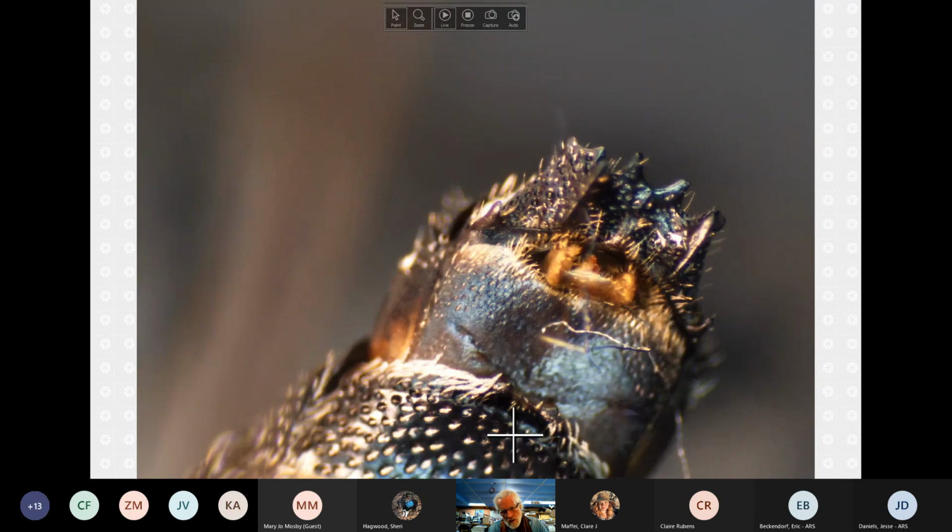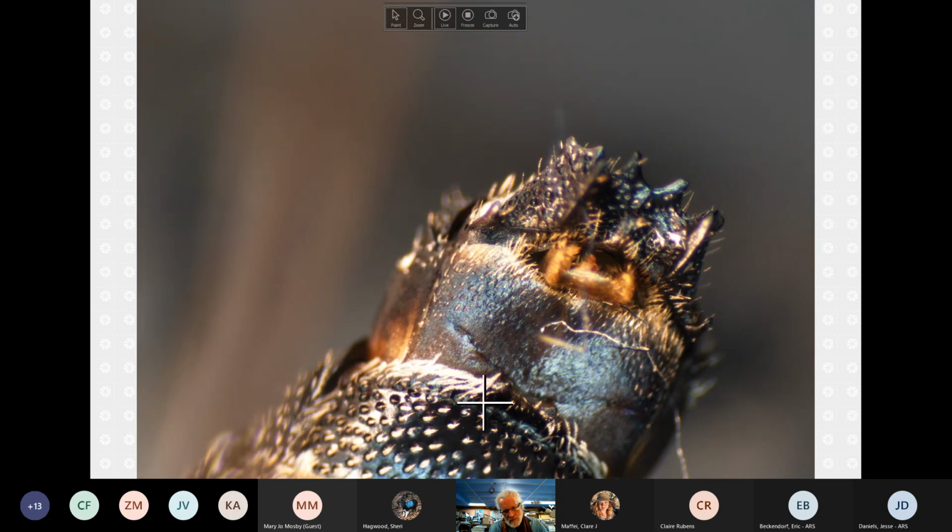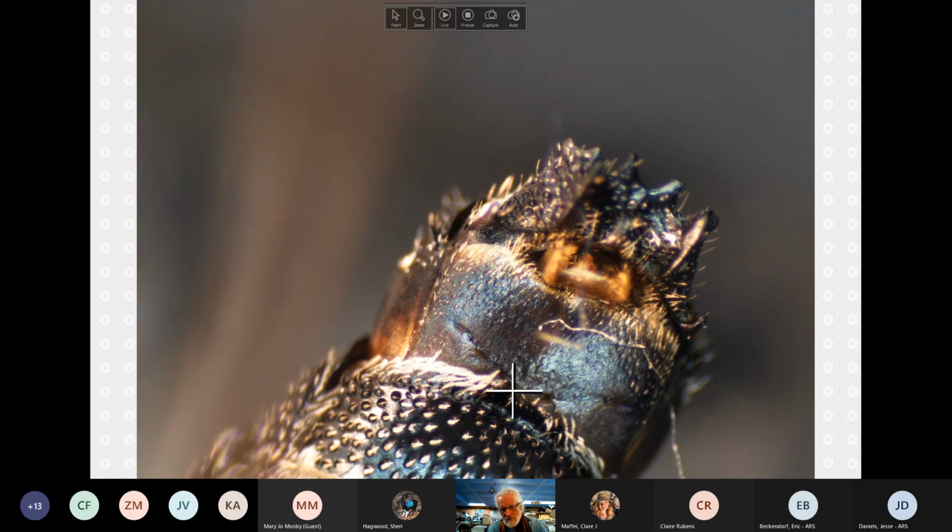So here's the one rim, and then there's this one rim edge, and then these are called double rims, I think, in the Coelioxys parlance. And then there's a second one here that's just peeking out, and it's, I think, a little bit hard to see, but I think you might be able to have a notion that that's concave or notched at the tip.